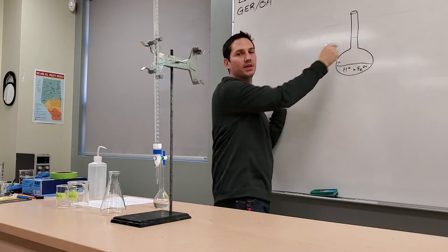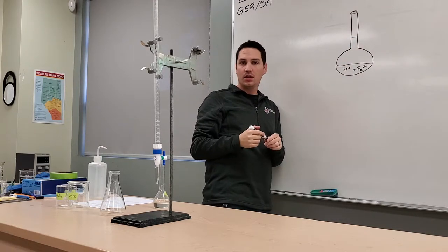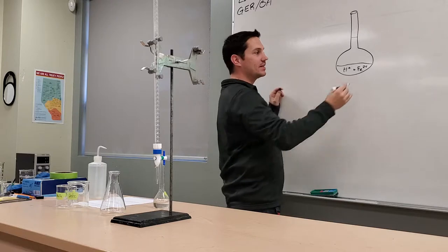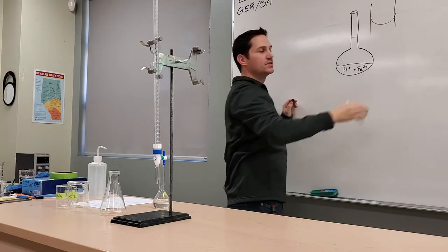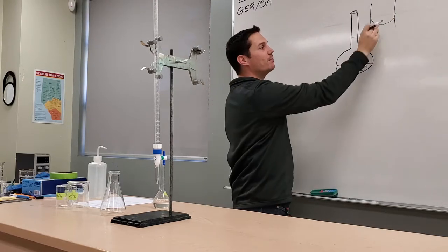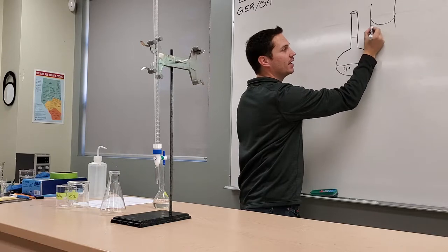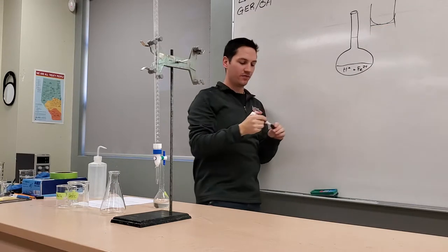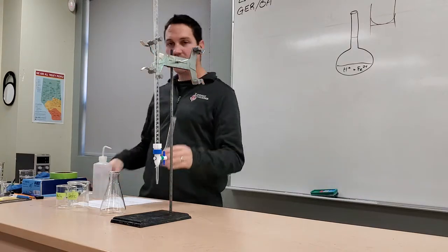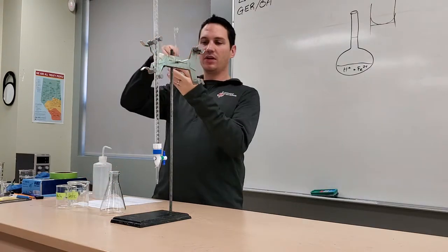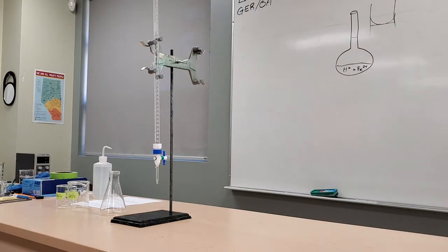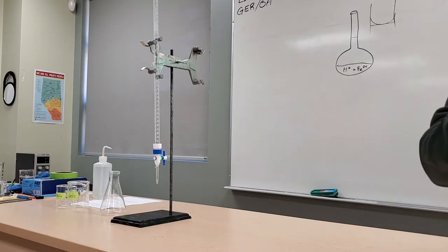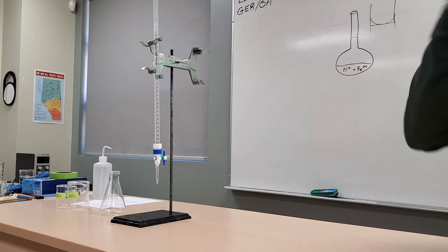You gotta fill this all the way up to 100. Do you remember how to use a volumetric flask? There's a very specific graduation on here, a very specific line, and you wanna fill up the rest. You added your acid and your iron 2+ for 40 milliliters. Now you gotta top it up with distilled water all the way until that point. But what's the key part about this? The meniscus. Your water's gonna have a meniscus on the edges of the glass, and the very bottom of that meniscus has to be at the level of the calibration line. Find an appropriate stopper that actually fits your container, and just invert it 10 times, because you're just trying to mix the distilled water, the acid, and the iron.